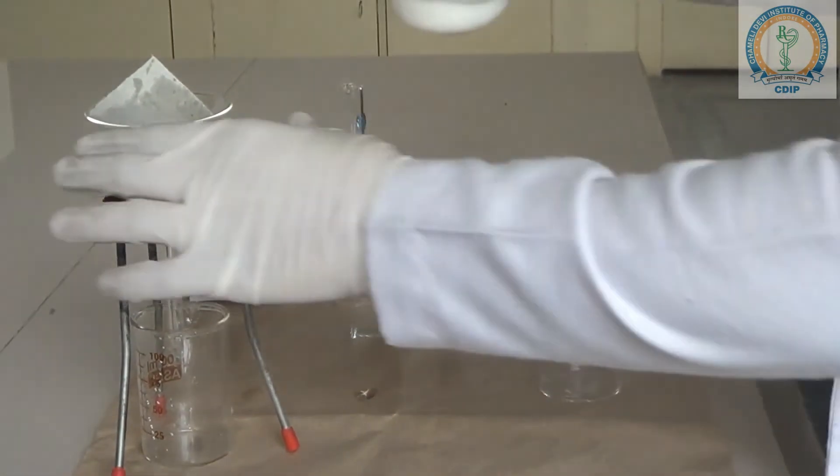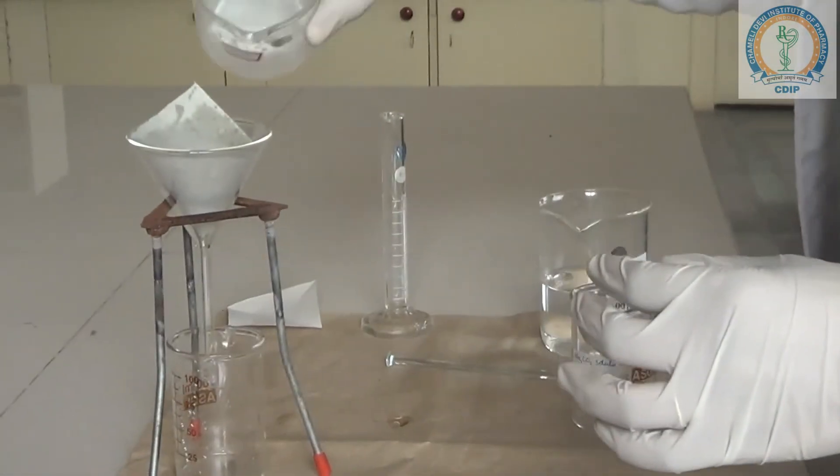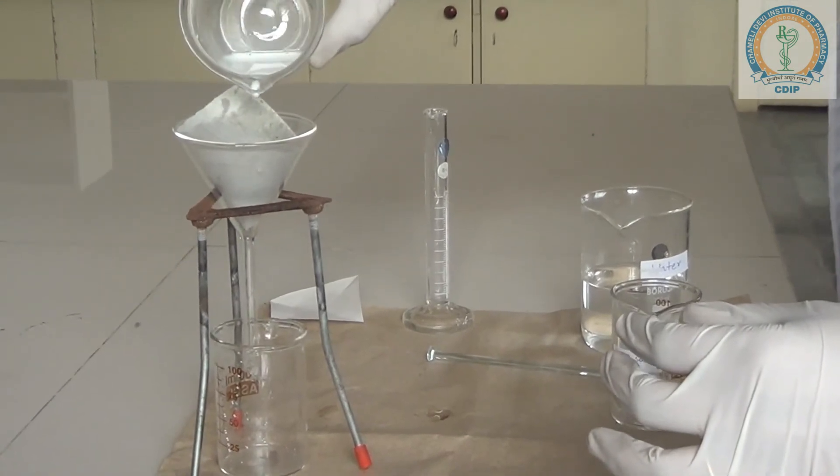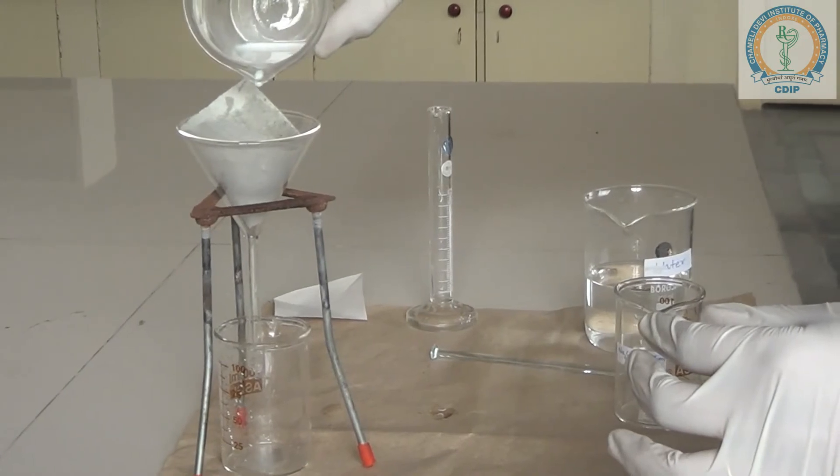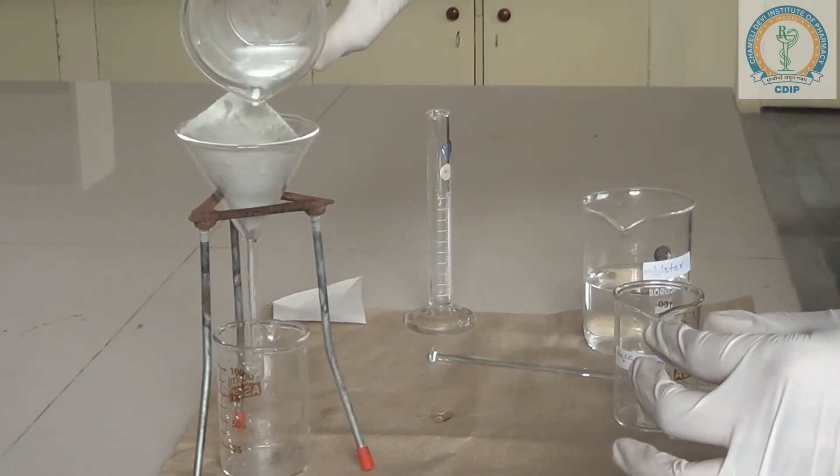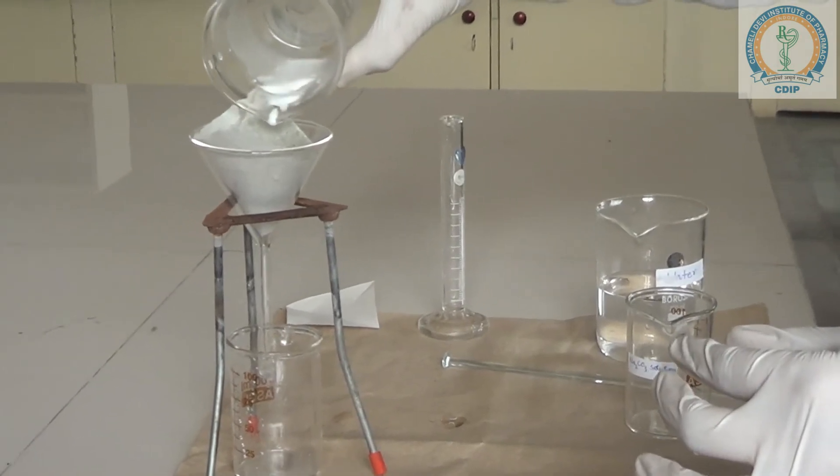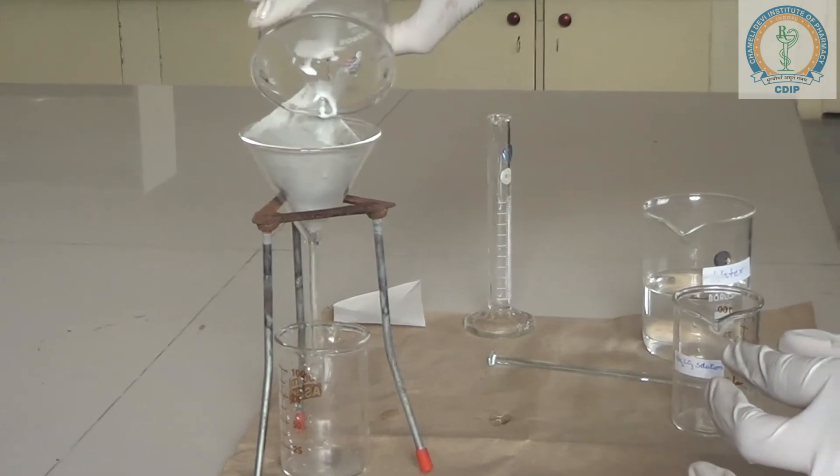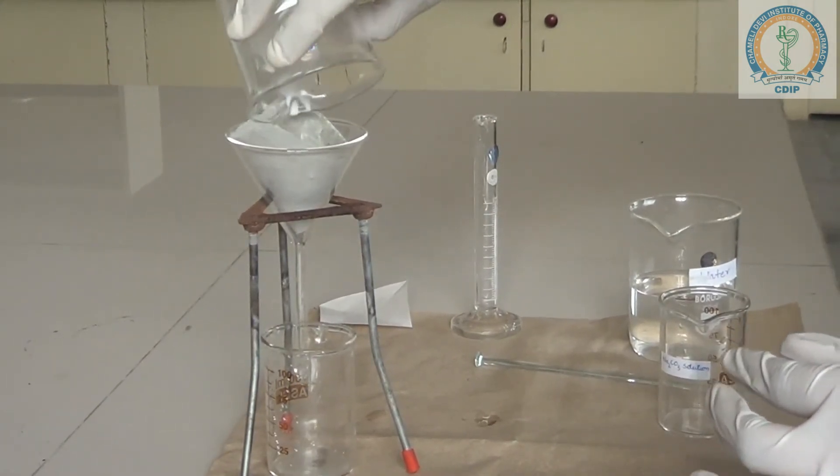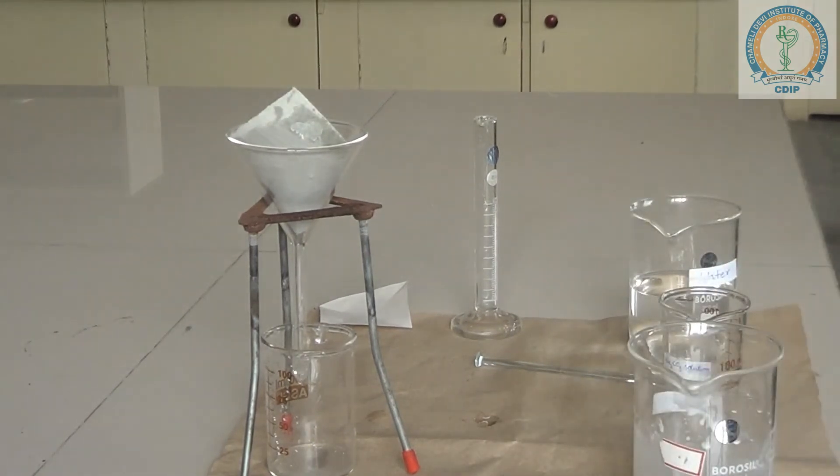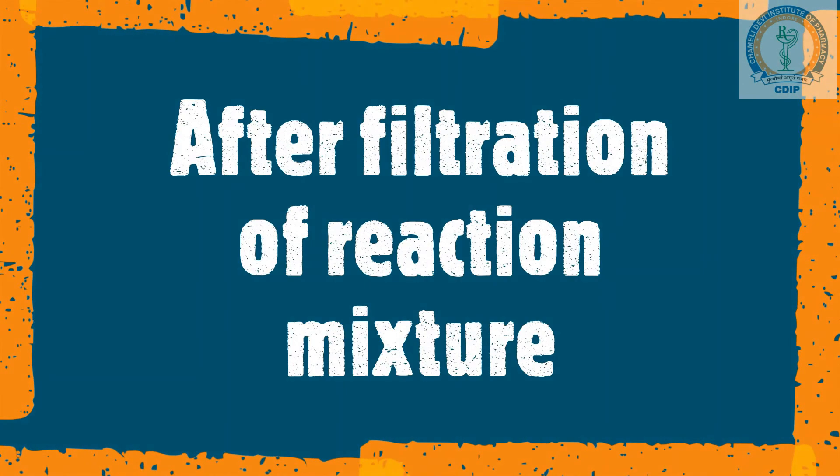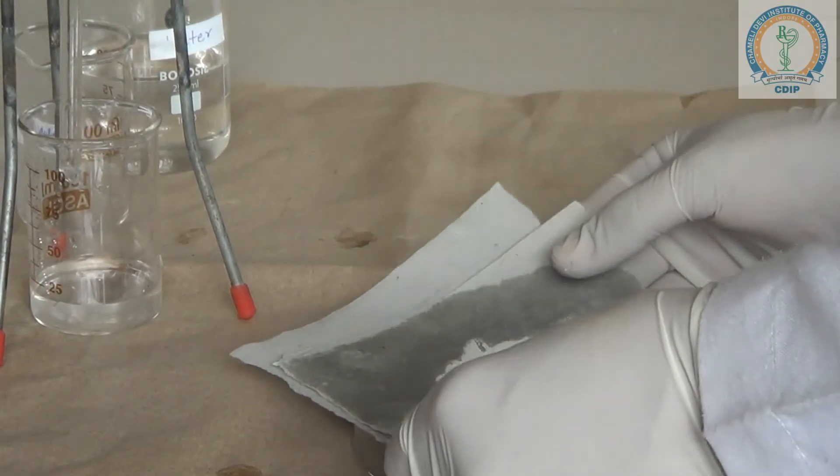Now we are going to filter this solution of calcium carbonate. So this is the preparation of calcium carbonate. Our calcium carbonate is prepared and after the filtration you will have to air dry it. So this is our required calcium carbonate powder.